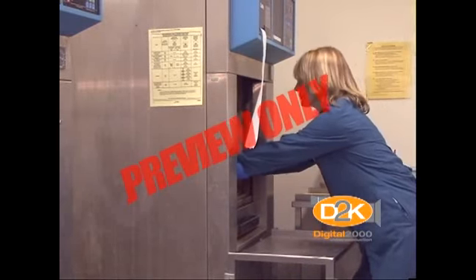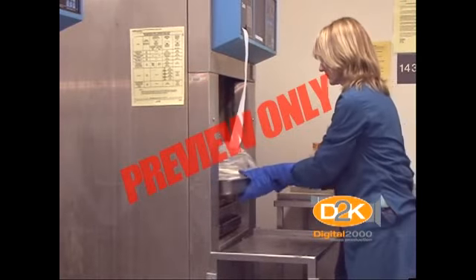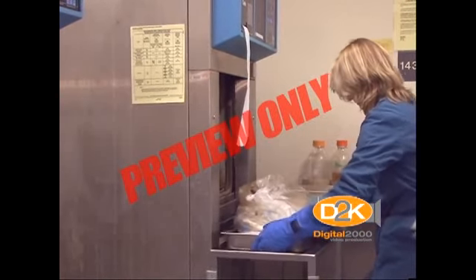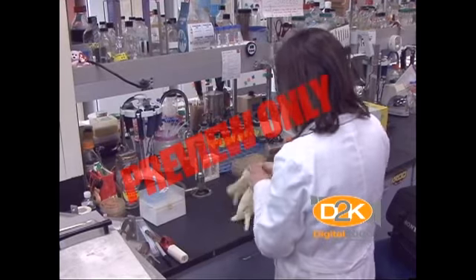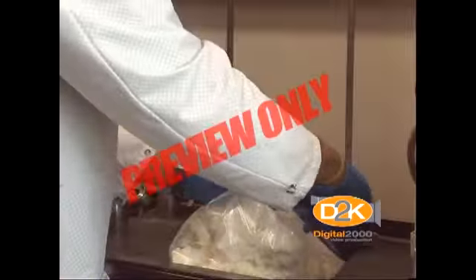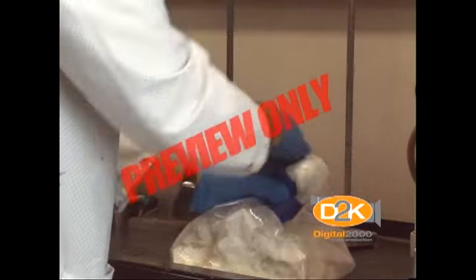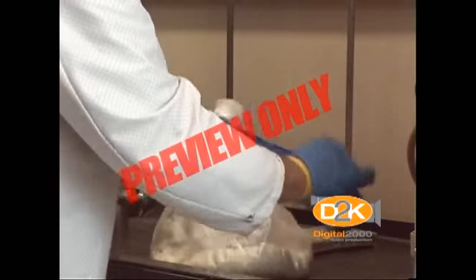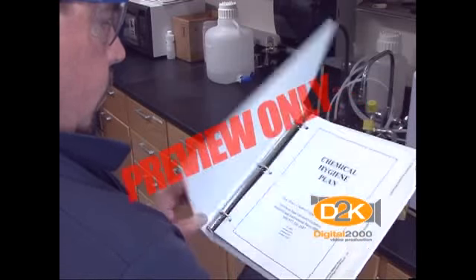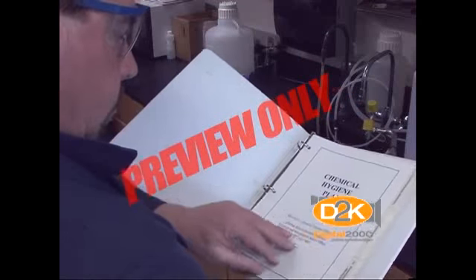This Biological Safety Program has been developed to provide you with guidance on the safe handling of biological materials, safety practices to minimize the risk of exposure to potentially infectious materials, and procedures for proper use, storage, transfer, and disposal of biological materials. This program is intended for use with your chemical hygiene plan.